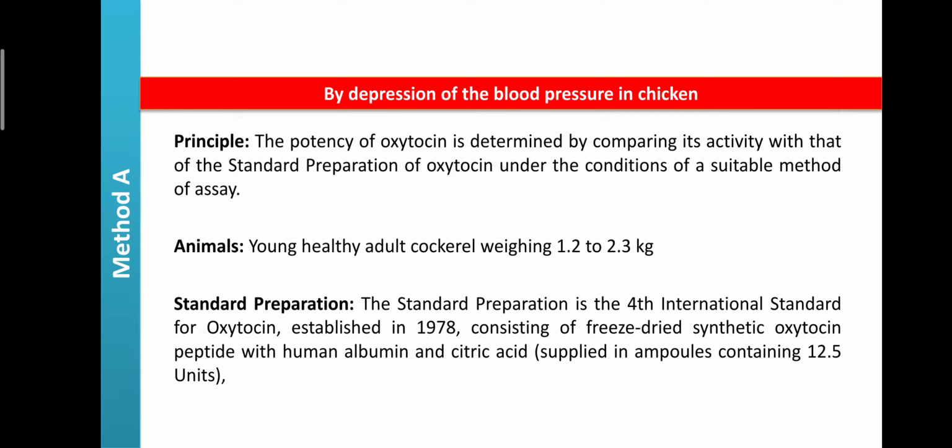Even the intake of water can alter the functions, and when you take food, our blood pressure automatically increases, which can give false results. That's why the food is withheld 18 hours before the experiment, because digestion is involved up to 6 to 8 hours. So the animals are fasted for 18 hours, with water withdrawn during the experiments.